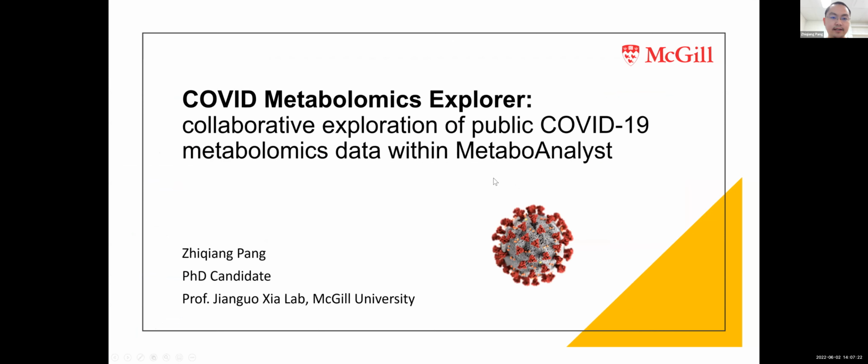Today, I'm going to present the COVID Metabolomics Explorer, a web tool for collaborative exploration of public COVID-19 metabolomics datasets within MetaboAnalyst.